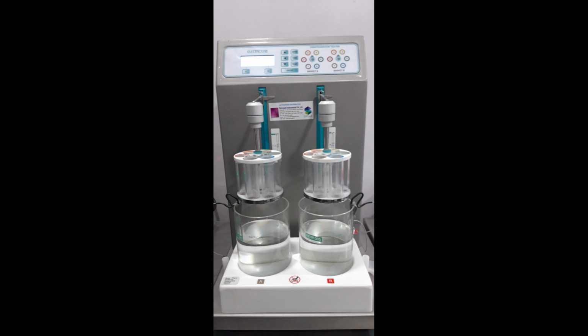4. Enteric coated tablets and capsules, delayed release. These require a two-stage disintegration test.